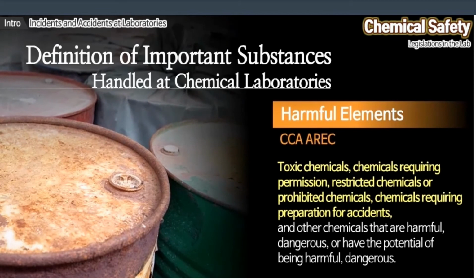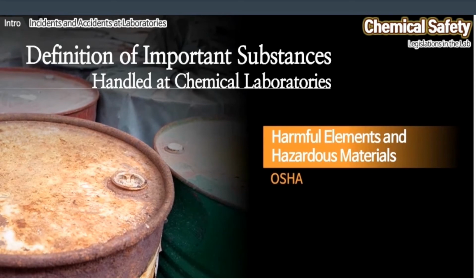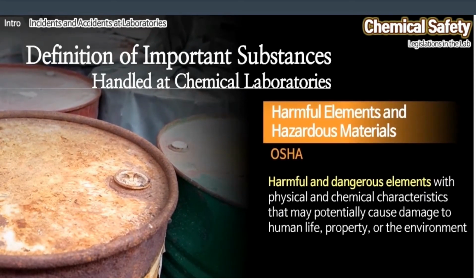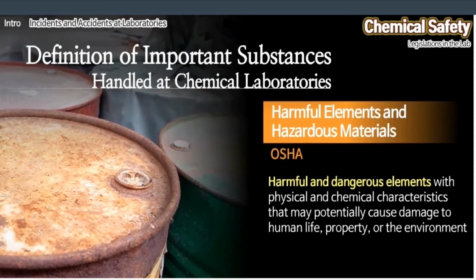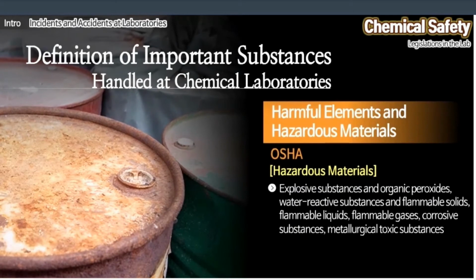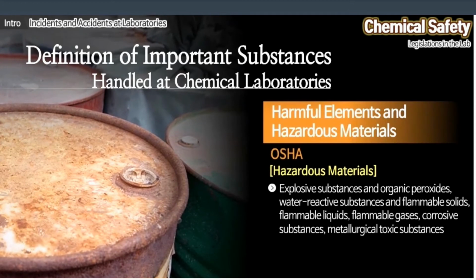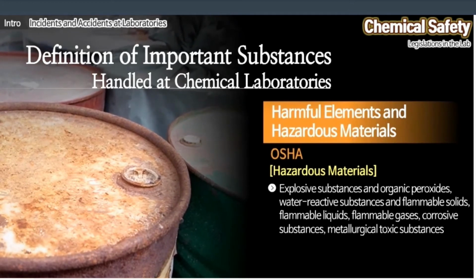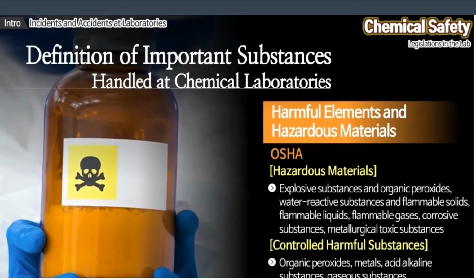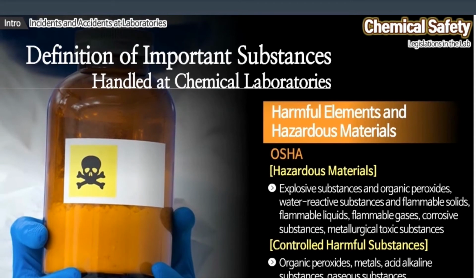of chemicals. Harmful elements and hazardous materials are defined under the Occupational Safety and Health Act. Harmful and dangerous elements refer to those with physical and chemical characteristics that may potentially cause damage to human life, property, or the environment. Meanwhile, hazardous materials include explosive substances and organic peroxides, water-reactive substances, flammable solids, flammable liquids, flammable gases, corrosive substances, and metallurgical toxic substances. Finally, controlled harmful substances refer to organic peroxides, metals, acid-alkaline substances, and gaseous substances.